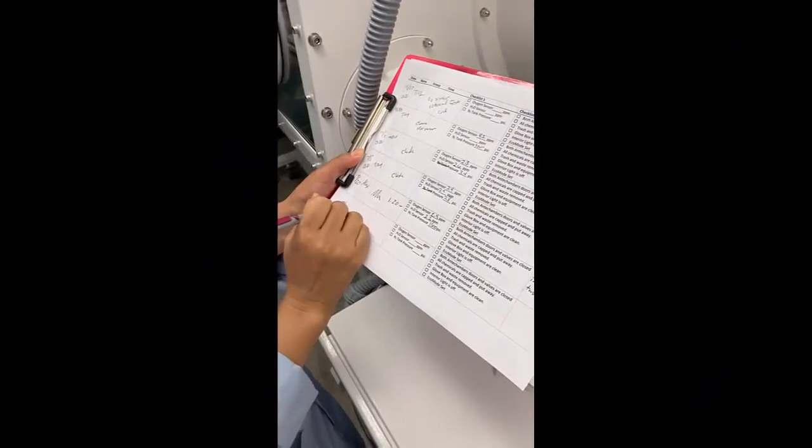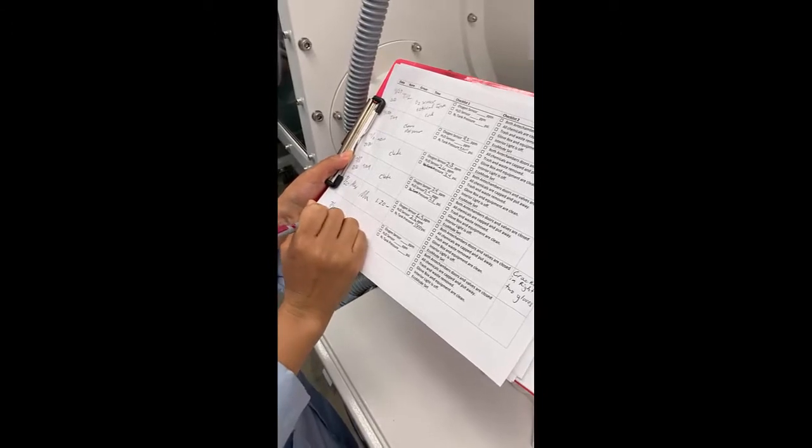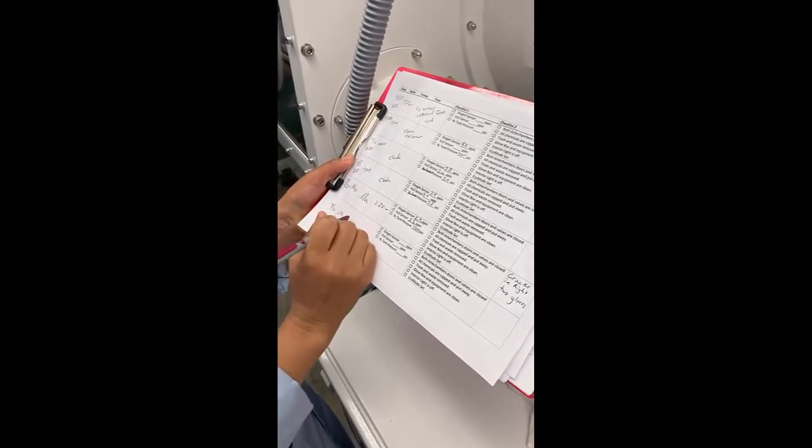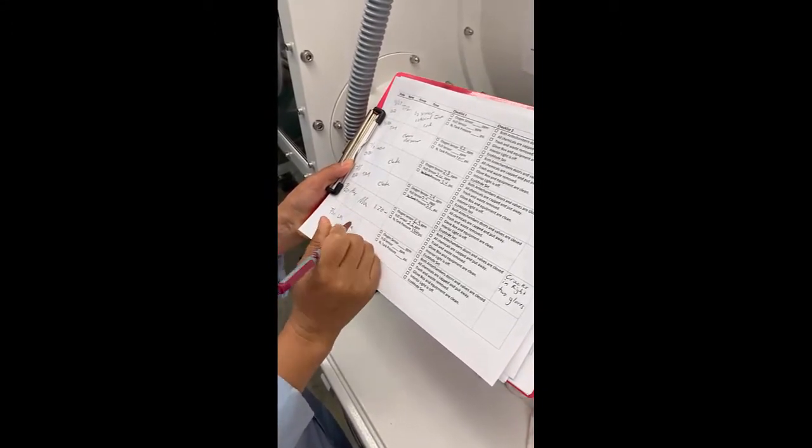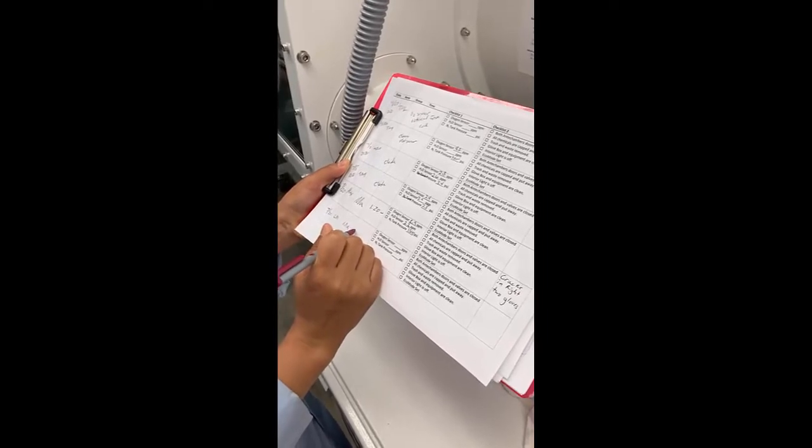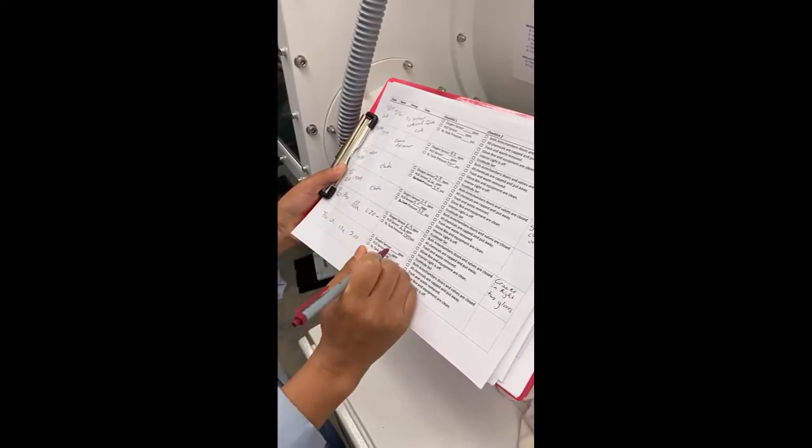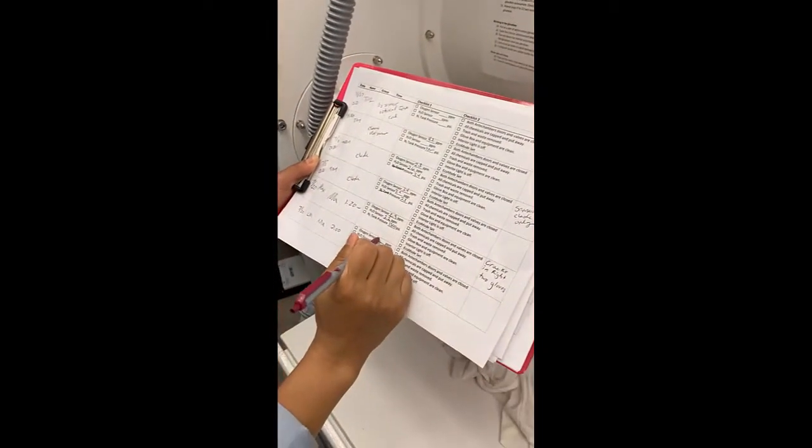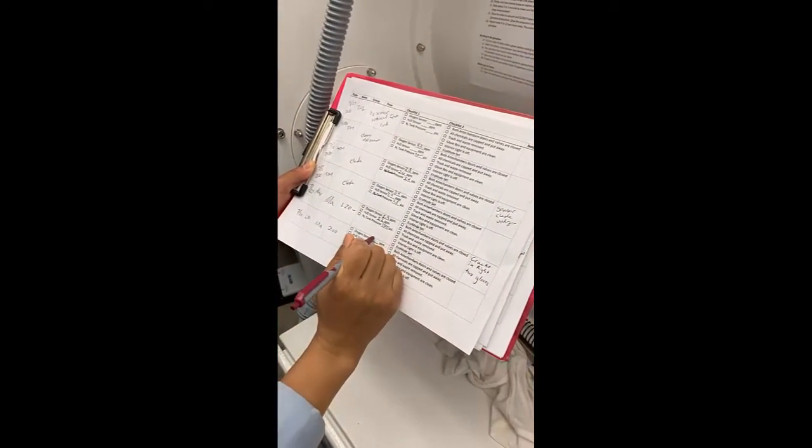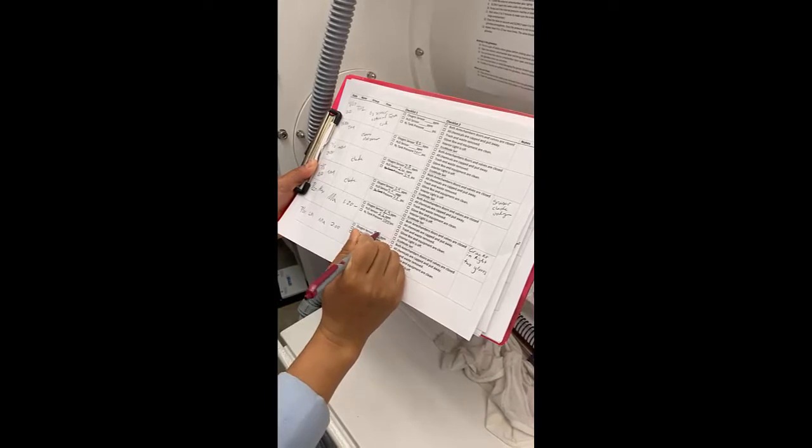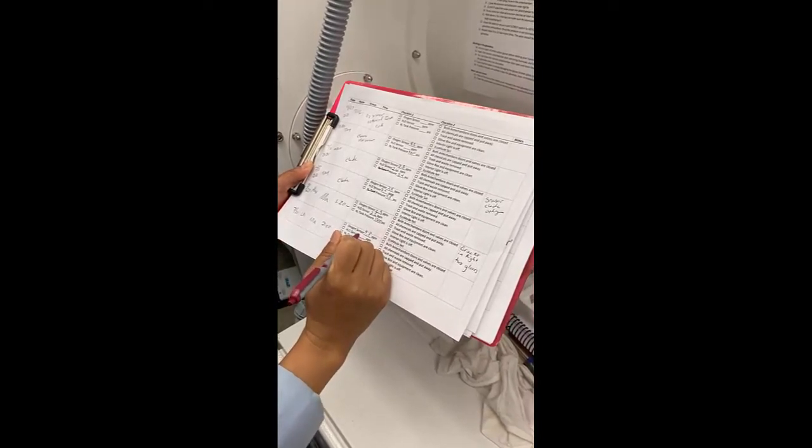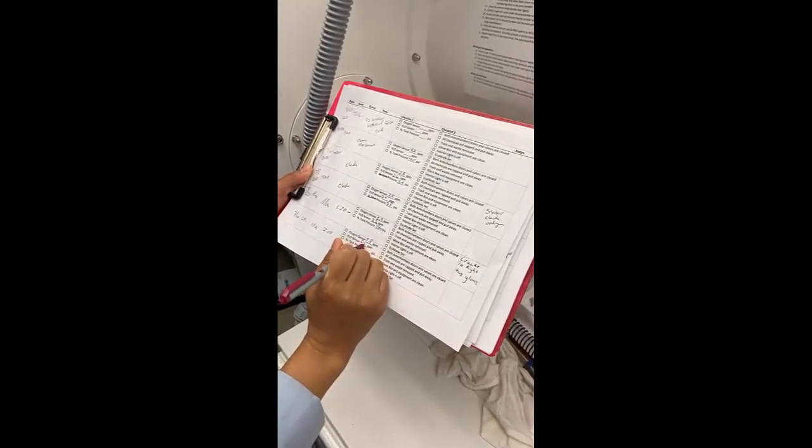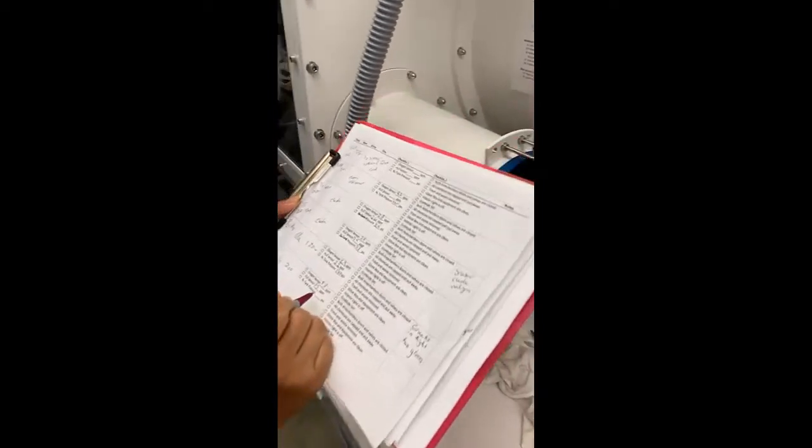So the first thing you need to do is fill out the check-in paper with the date, your name, the group, the time that you are entering the glove box, and the sensors - the H2O and the O2, and then the N2 tank pressure.